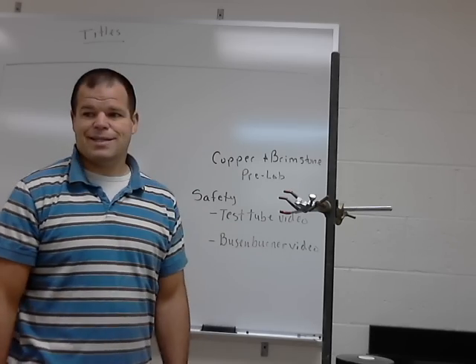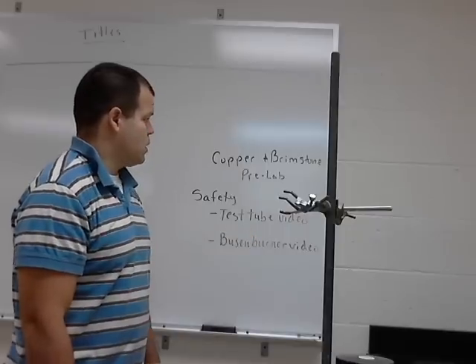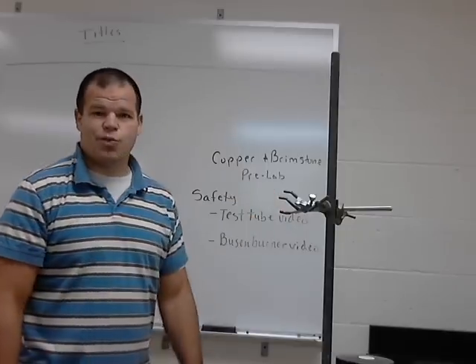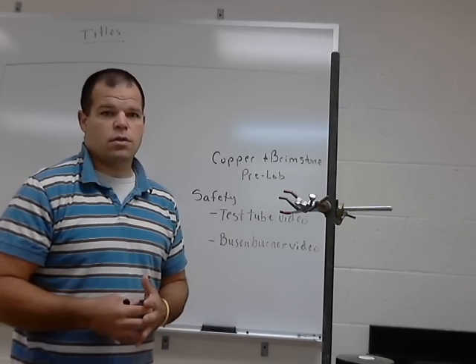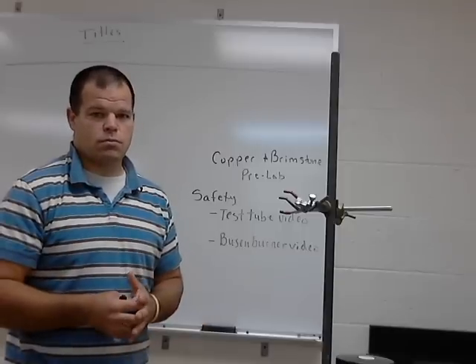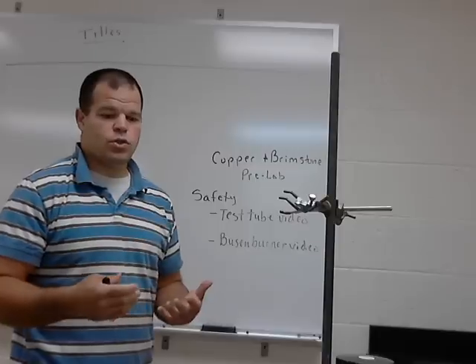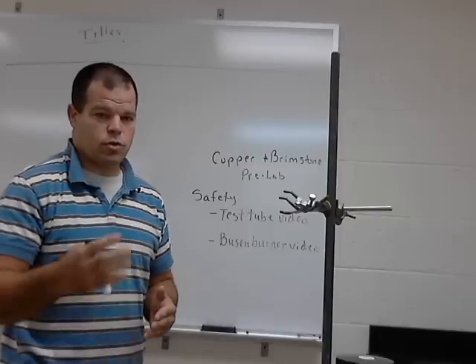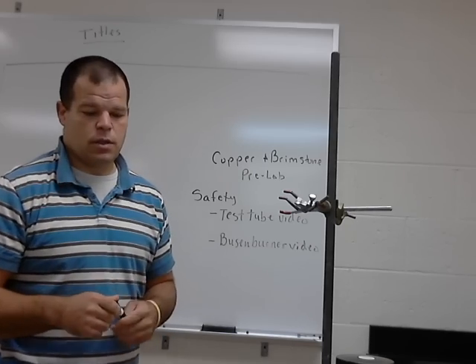We're also going to be heating test tubes, so you're going to want to make sure you watch that test tube video. Knowing and completing your pre-lab might even be as critical of a safety concern. Knowing what you're doing in lab is of the utmost importance. Okay? So I'm going to walk through the pre-lab materials and what you need to do for your pre-lab first, and then we'll talk about some of the lab specifics.